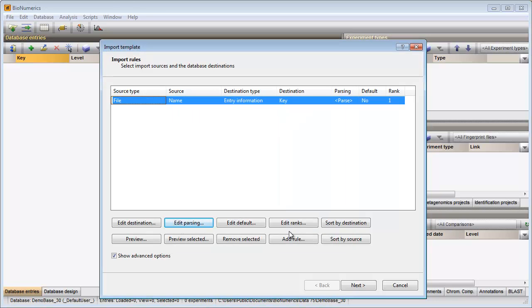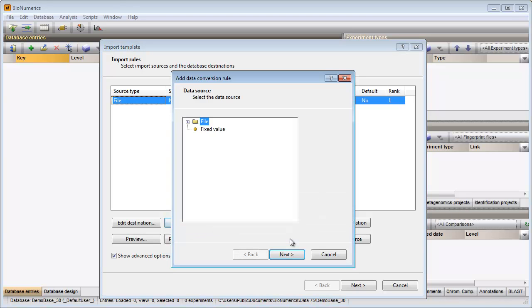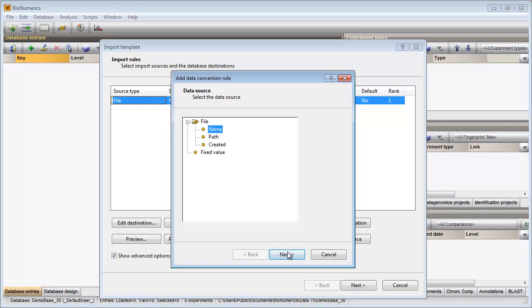The sequence experiment names can also be parsed from the file names. I will now add a second rule that will link this information to the sequence experiments in my database. I select the add rule button, I select file name as my starting point and sequence type as my data destination.